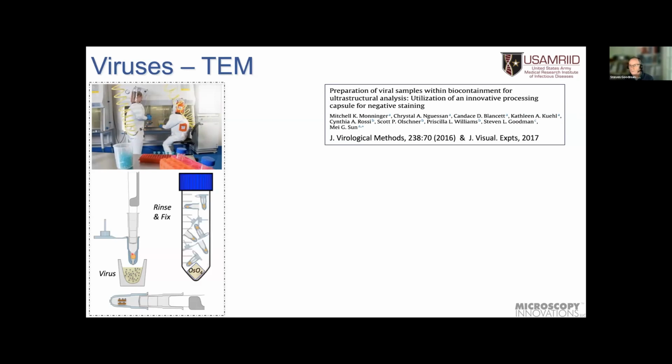And then they use one of two methods. They would take the capsules off, place them into a 50 ml centrifuge tube with an osmium tetroxide impregnated piece of filter paper, and they would then fix them and effectively deactivate the virus in the osmium vapor, or they would fill the whole chamber with glutaraldehyde. The glutaraldehyde, they'd have to sit in the glutaraldehyde solution for 24 hours. With the osmium vapor, if I recall correctly, it was simply 1 hour.